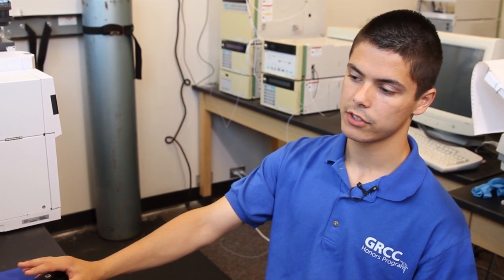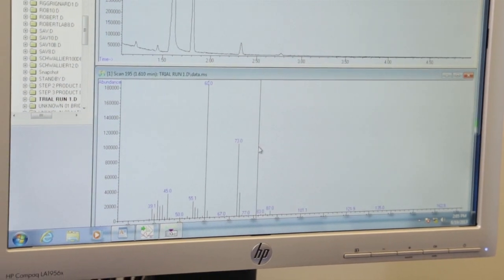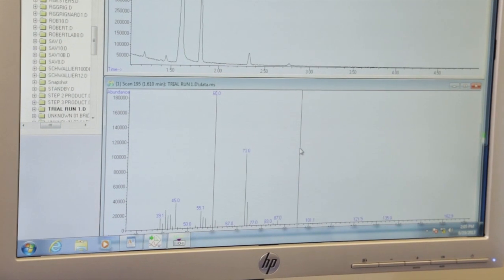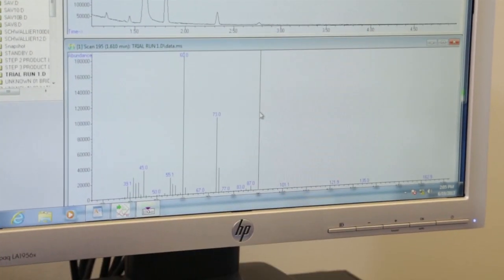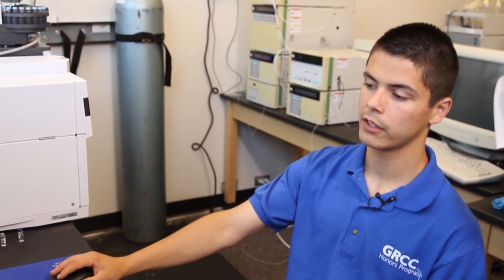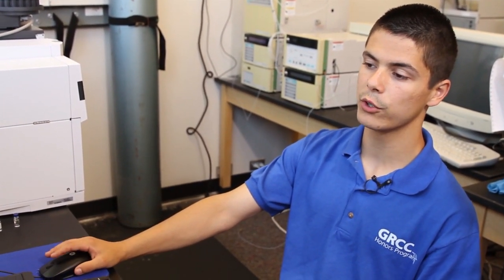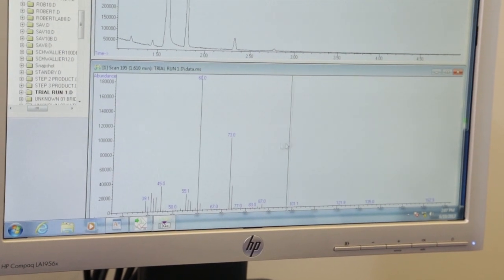From the mass spectrum we can determine what our unknown is. The mass of 73 is probably the parent mass — the mass of the entire molecule. When it goes through the mass spectrum, different parts of the compound get broken off and ionized. Most likely there was a loss of about 12 or 13, which could be carbon or nitrogen. From the fragmentation pattern we can tell there's probably a carbon, hydrogen, or nitrogen in there. This unknown happens to be propanoic acid. We took an unknown sample we had no idea about, diluted it, ran it through the GC MassSpec, and were able to interpret the data and figure out what our unknown was.